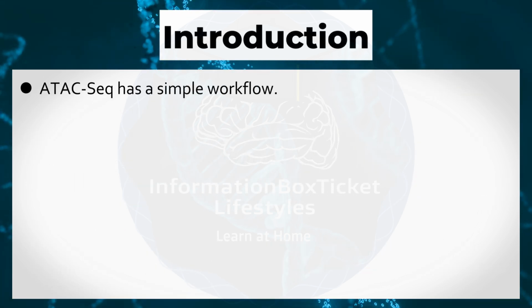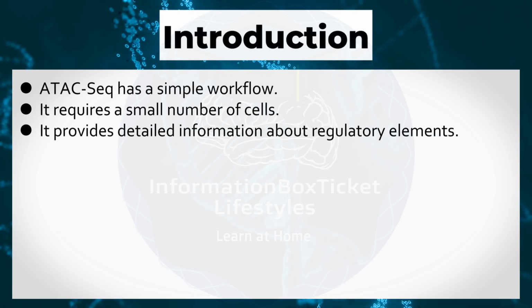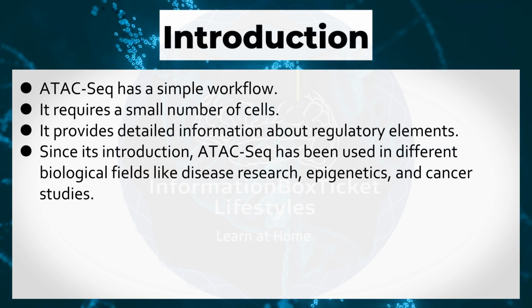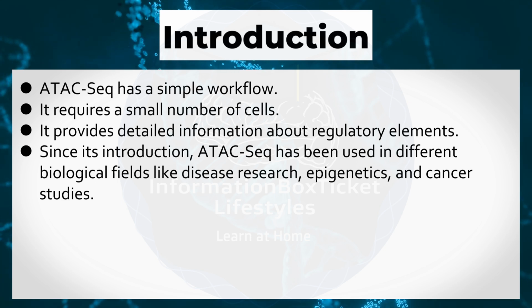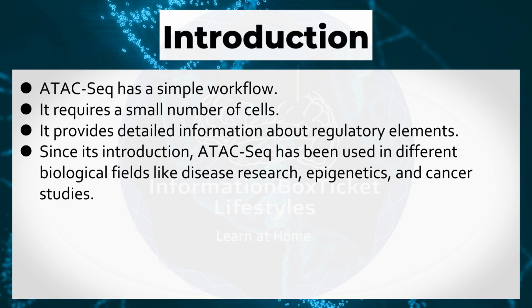ATAC-Seq has a simple workflow. It requires a small number of cells. It provides detailed information about regulatory elements. Since its introduction, ATAC-Seq has been used in different biological fields like disease research, epigenetics, and cancer studies.